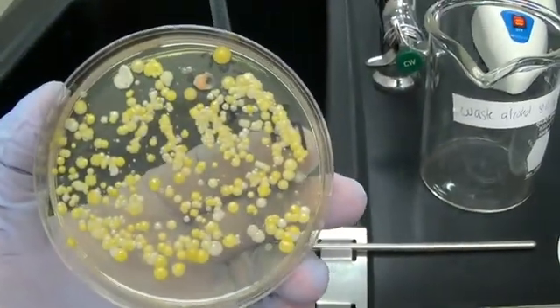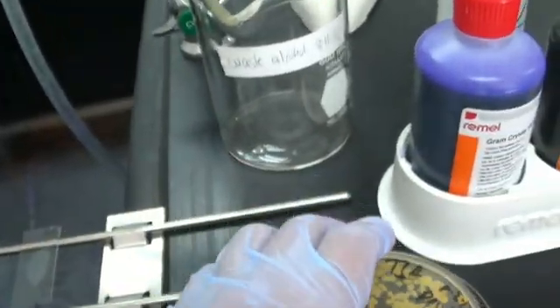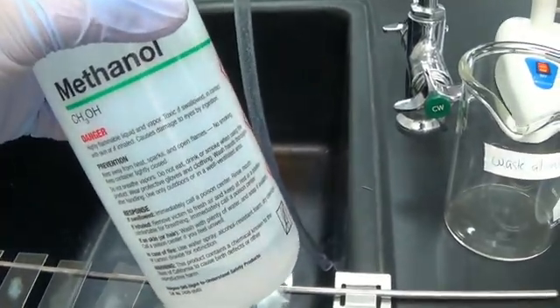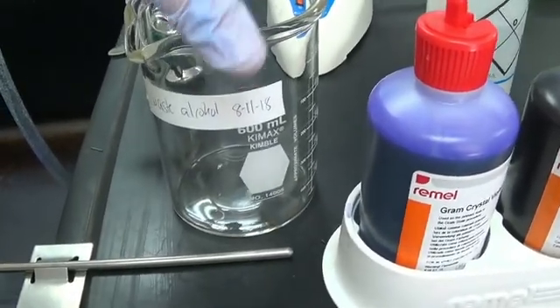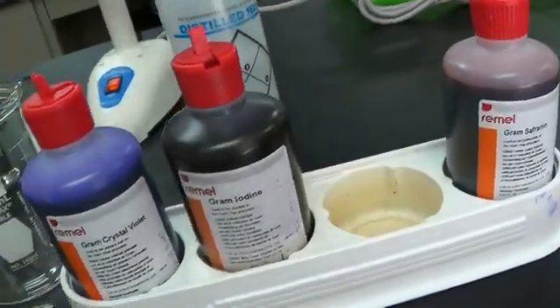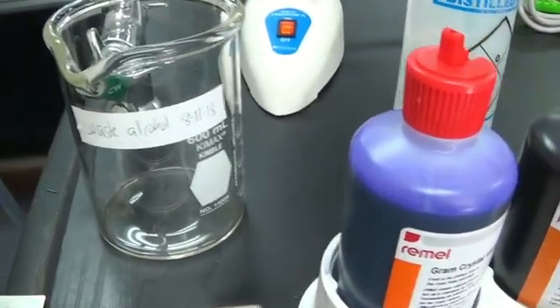Think about it this way: a plate full of bacteria has some young bugs and some old bugs. Some are very young and can hold the stain well; some are older and will not hold the stain well. Methanol seems to help them keep their stain. The decolorizer also has alcohol and some acetone in it, so that also goes into the waste bottle. If we are required to store waste alcohols, we should be doing that.